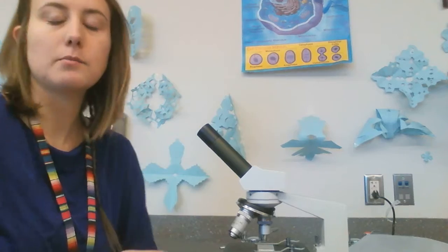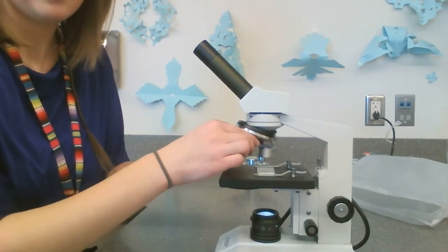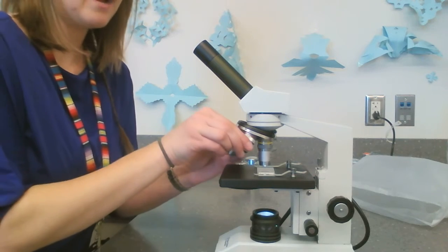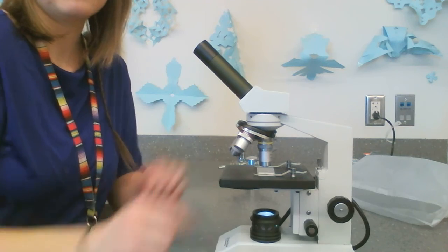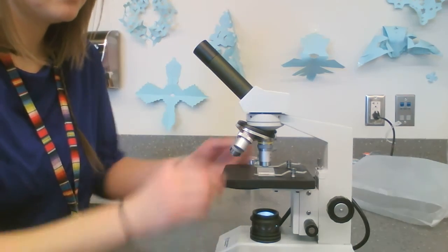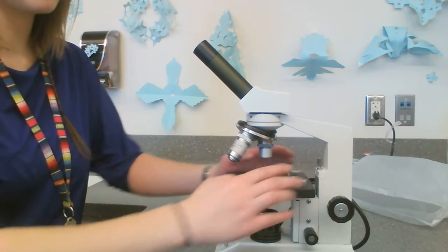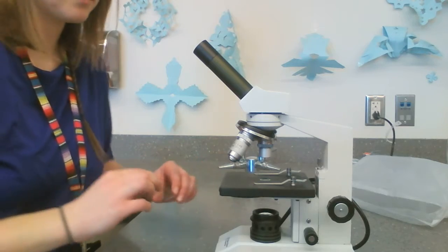Now, once I've looked at my specimen on low power, then I can change it to a higher power objective. I would look from the side to make sure I'm not going to ram the objective into the stage, and then I would shift it to a higher power objective, okay? If you're halfway between objectives, it's not going to show anything, so make sure you let it click so that the objective is in place, okay? When you're all the way done, you turn it back to the low power objective, lower the stage all the way down with the coarse adjustment knob, turn off the light source, remove the slide from the stage, and then you would bring the slide back to me, okay?